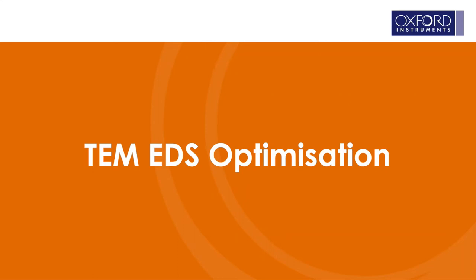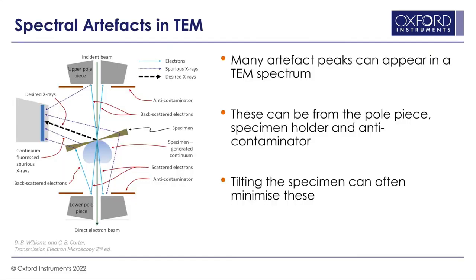How can we optimize our TEM analysis? One thing to be aware of is just how complex the interaction between the electron beam and your TEM sample is — we're in a really confined space. One big challenge for TEM is minimizing spectral artifacts. With all of these components in close proximity, like the anti-contaminator, the pole piece, the specimen holder itself, we can often get x-rays that we're not wanting. Being aware of these x-rays and looking at ways to minimize these artifacts is important, and often the easiest way is just tilting the sample holder.